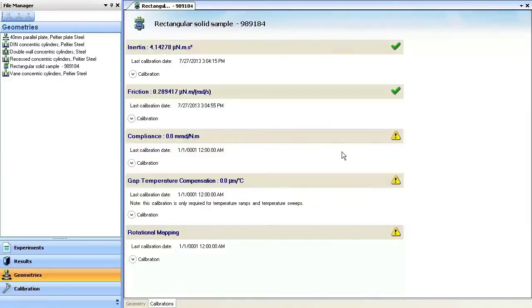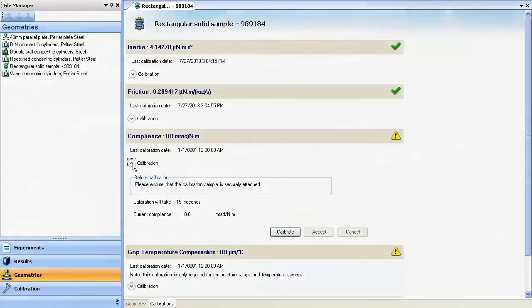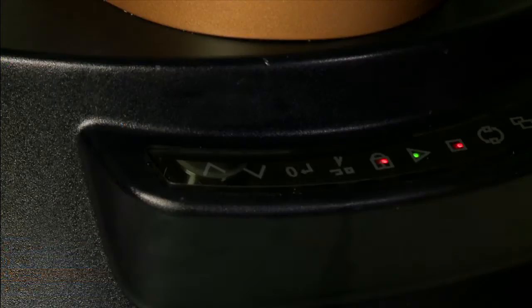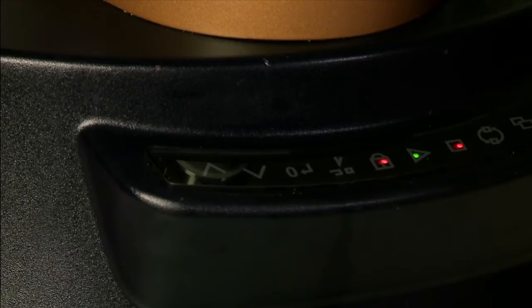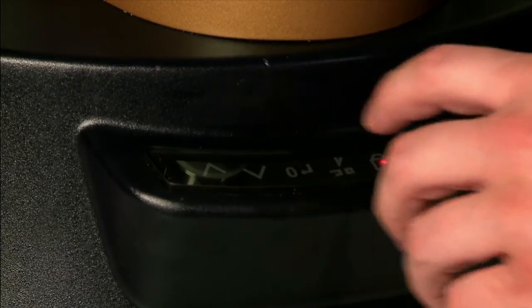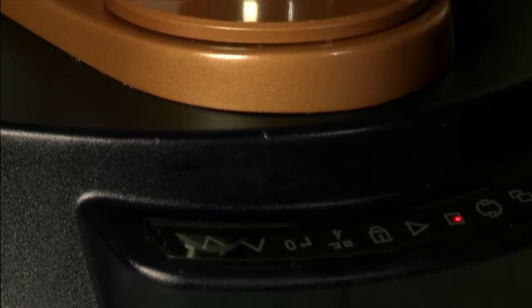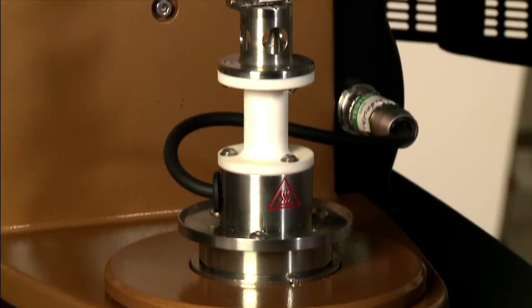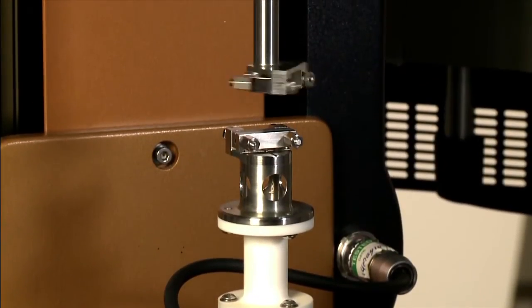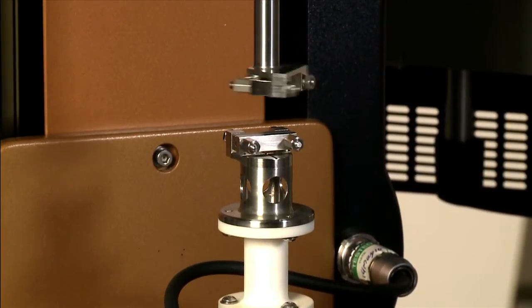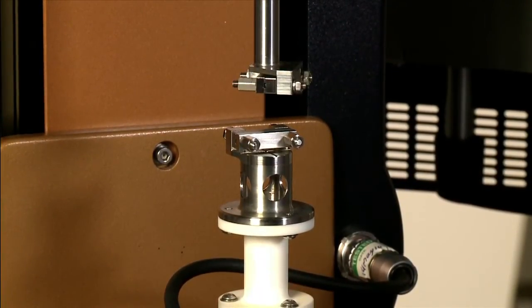Accept the friction calibration values and move on to loading the steel compliance sample for calibration. The first step before mounting the steel compliance sample is to zero the gap. While the gap is zeroing, the maximum length of sample you can use with the torsion geometry is 65mm.